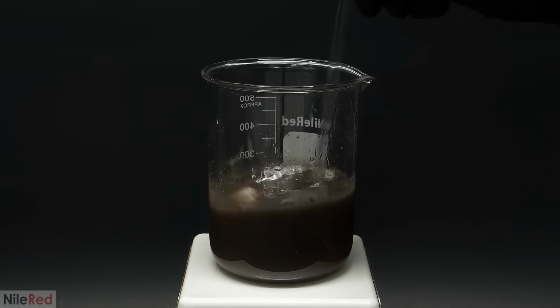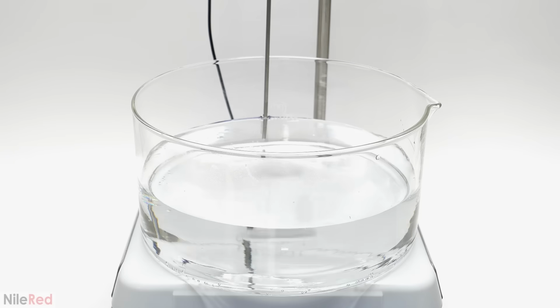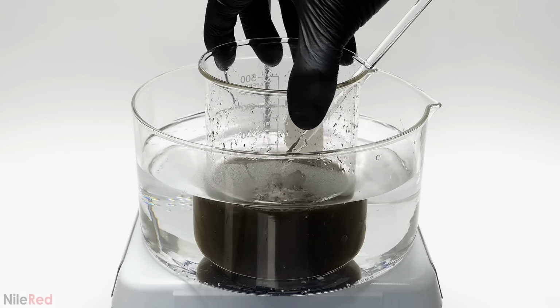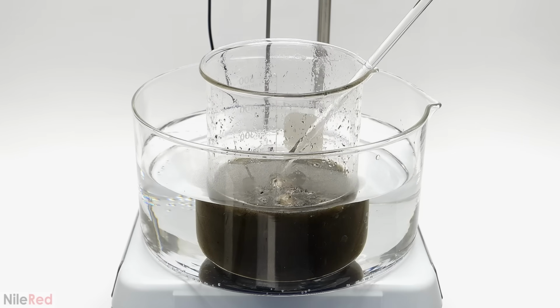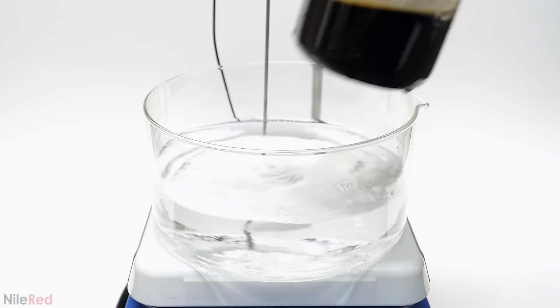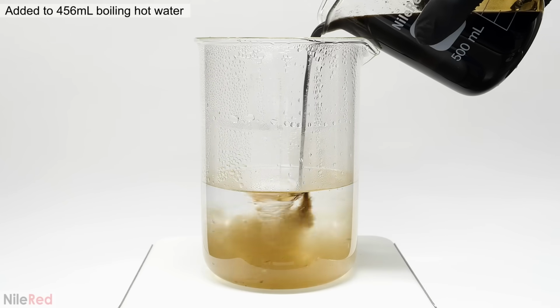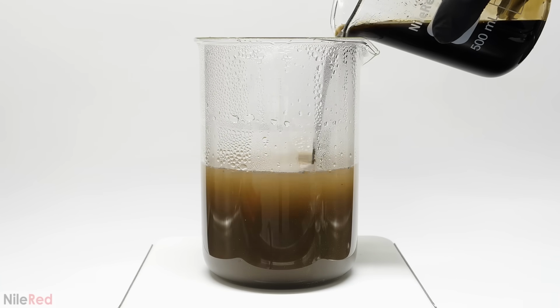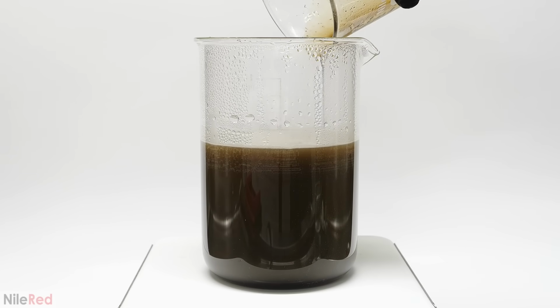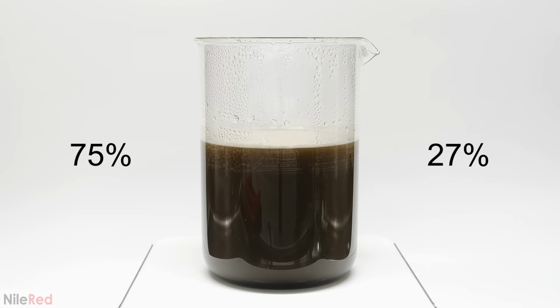Now at this point, things were looking pretty good, but to fully dissolve the cotton, I had to warm it up a bit. So I dropped it into a hot water bath at 50 C, and I let it sit there for 30 minutes. When it was done, it looked like all the cotton had disappeared, and I pulled it out of the bath. I then poured it into 456 milliliters of boiling hot water. This diluted the acid even more, and it brought it down from the 75% that I had before to 27%.